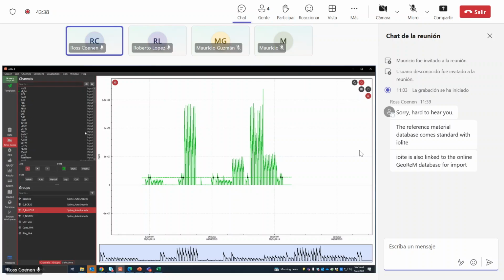Okay. Is there anything else anyone would like to see for today? Sí, está bien. Las dudas que tenía, y la última, sí, tengo una duda más. El blanco, ¿cómo lo hago? Just the last question, Ross. The blank, how can you make it?